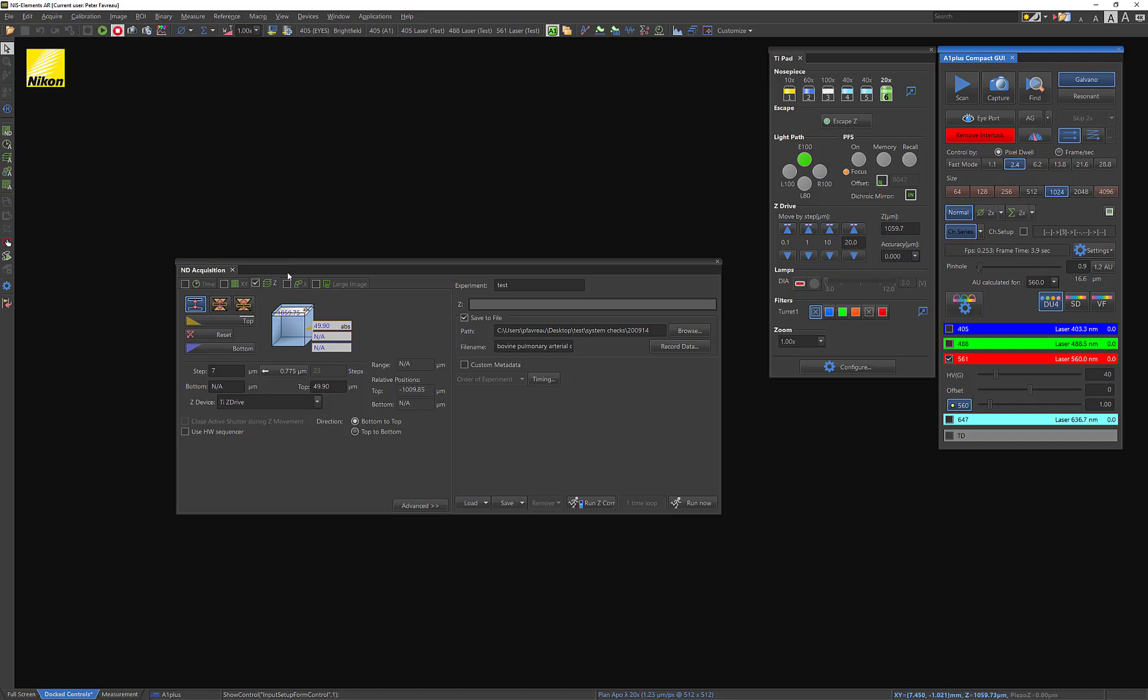So again, the first way of doing this is doing top and bottom. There's another way, which is a symmetric mode, where you basically tell it, just acquire a Z-Stack around this range, this volume, or this depth.